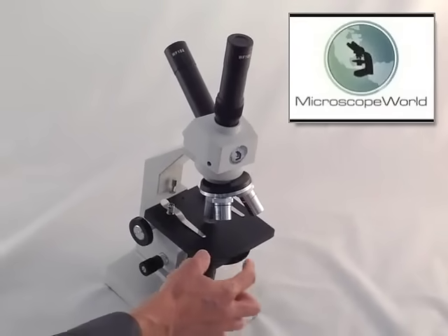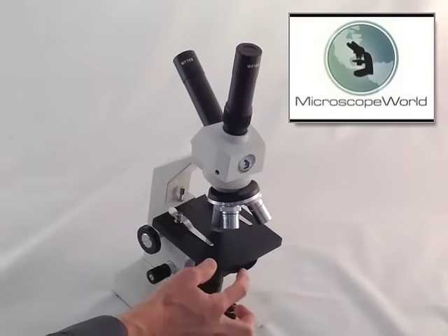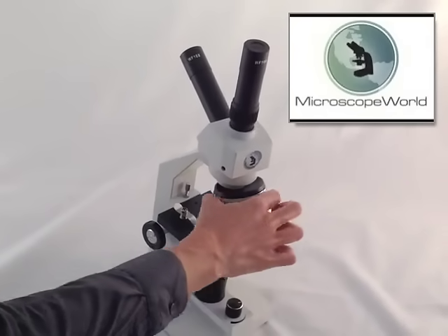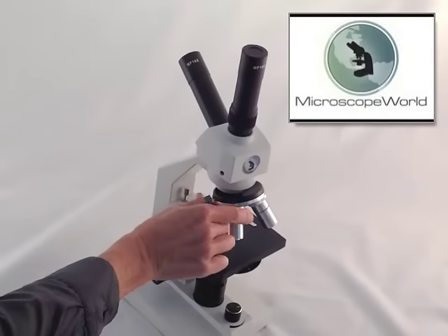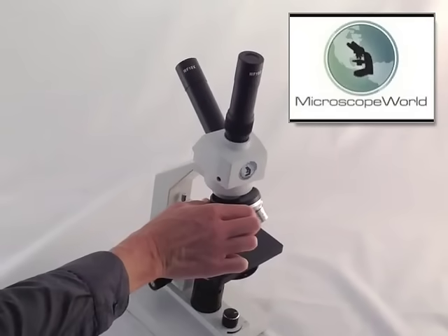Underneath the stage is a disc diaphragm which helps to improve resolution and edge definition. There are three objective lenses and they provide 40x, 100x, and 400x total magnification.